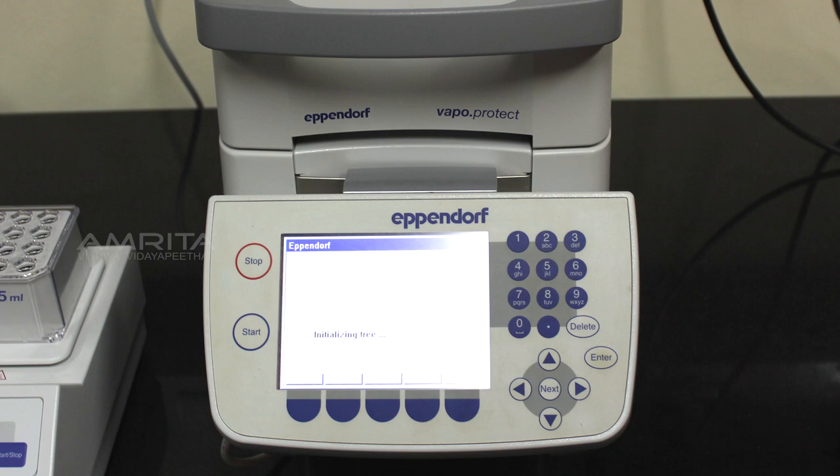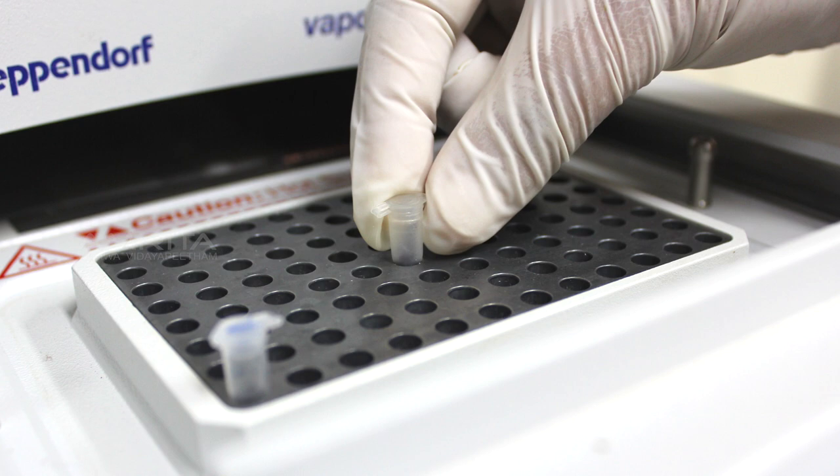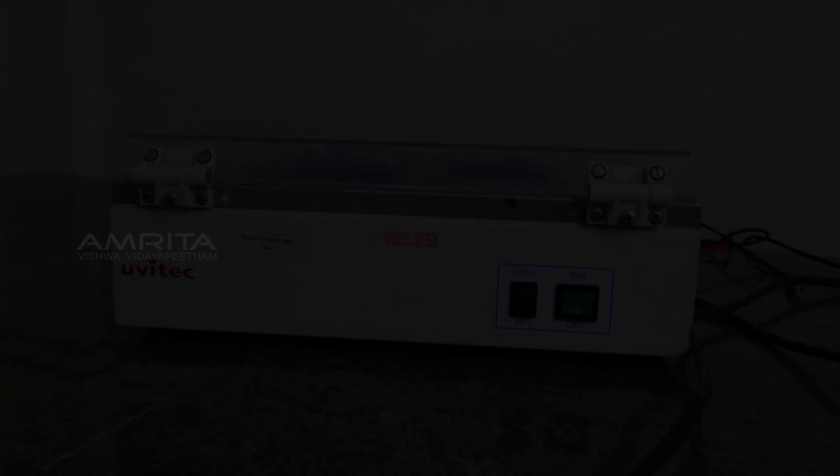Turn on the thermocycler. Place the PCR tube containing the reaction mix in the PCR machine. Close the lid and set the specific PCR program, then press the start button to run the PCR program. The amplicons formed after the specific amplification of the target sequence can be detected using the technique of gel electrophoresis.